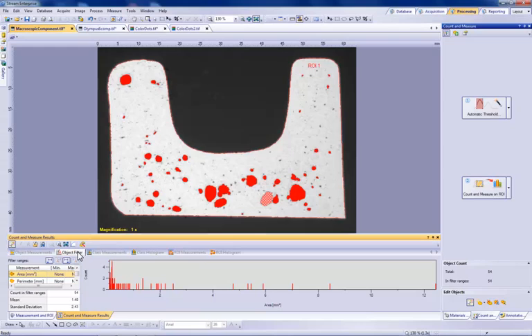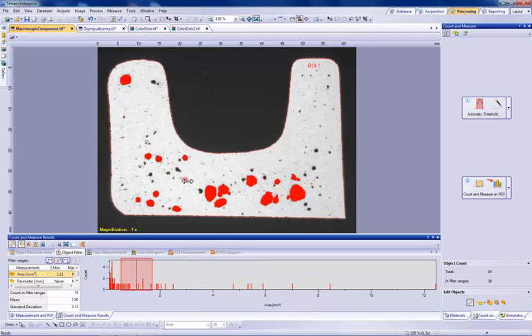To accomplish this, we simply select the minimum value button. Now we select the smallest object we want to be included in our measurement values, defining the minimum value. We can see that a minimum selection line was generated on our histogram. We can now select and drag this bar to change our minimum value based on area in millimeters squared.